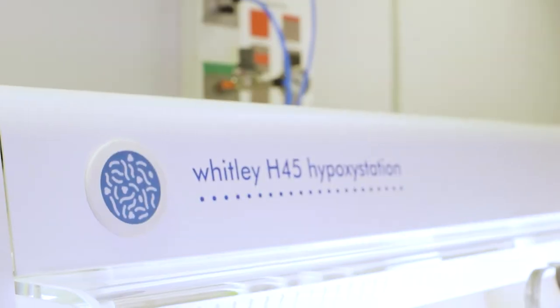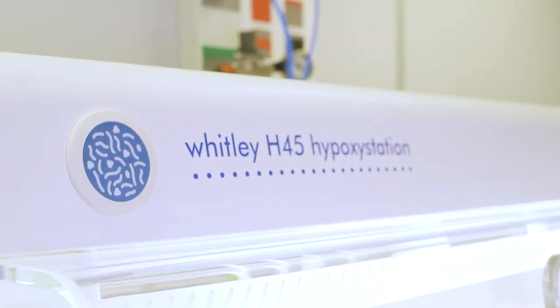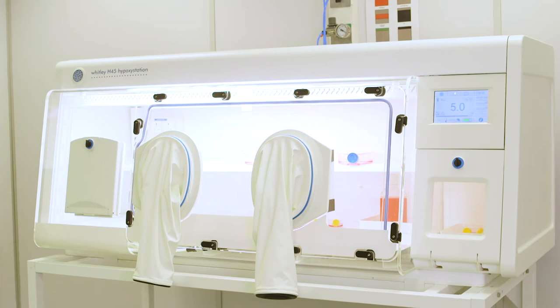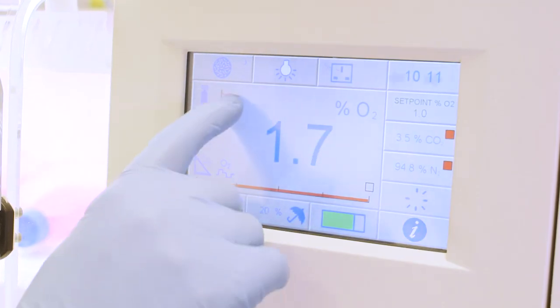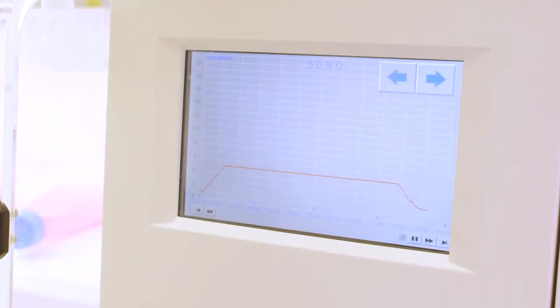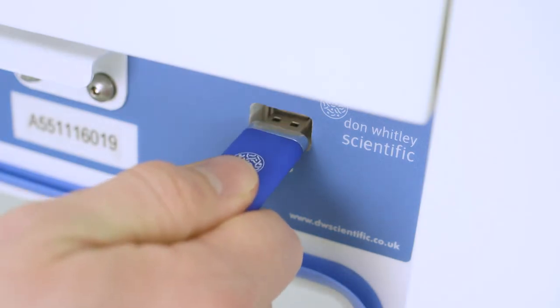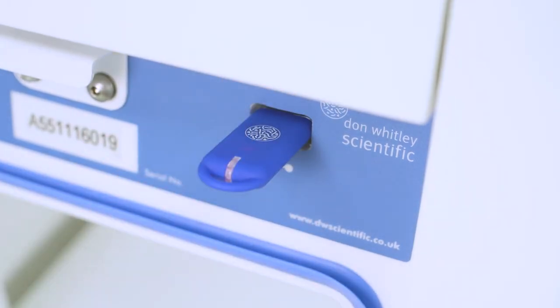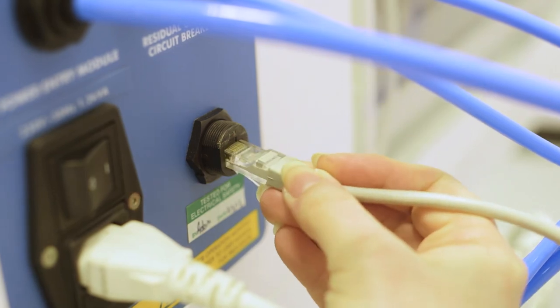The hypoxic station records parameters such as temperature, humidity, oxygen and CO2 levels. Recorded data can be viewed on the hypoxic station touch screen or downloaded in a few seconds via the USB interface or via an ethernet connection.